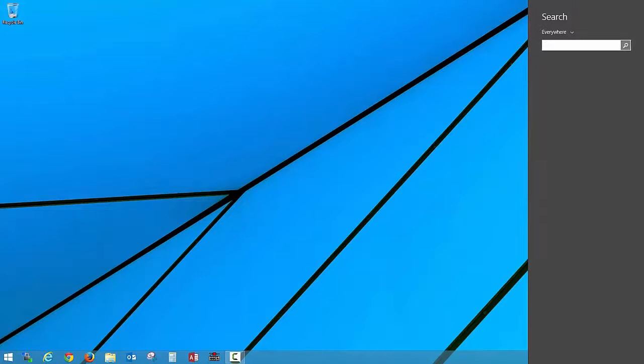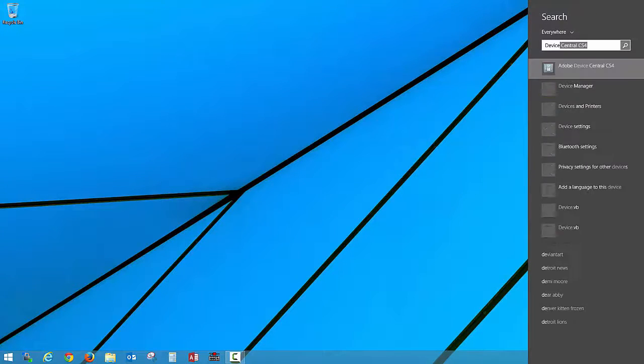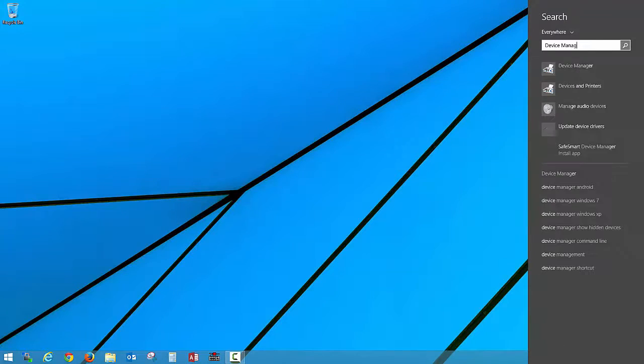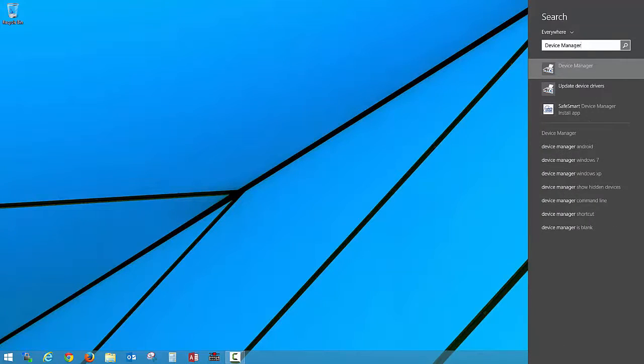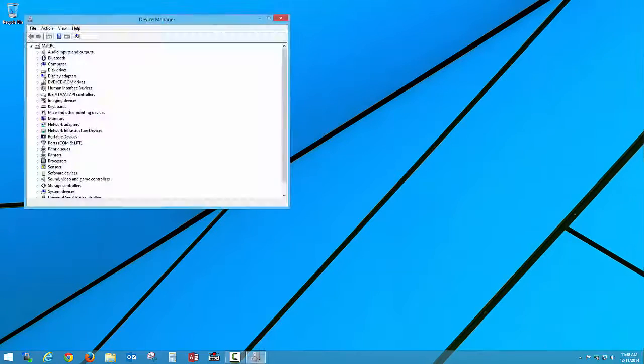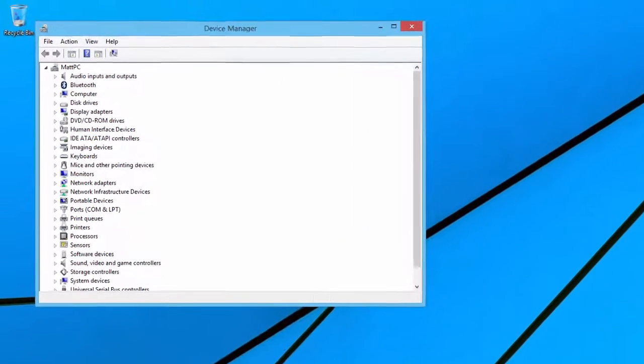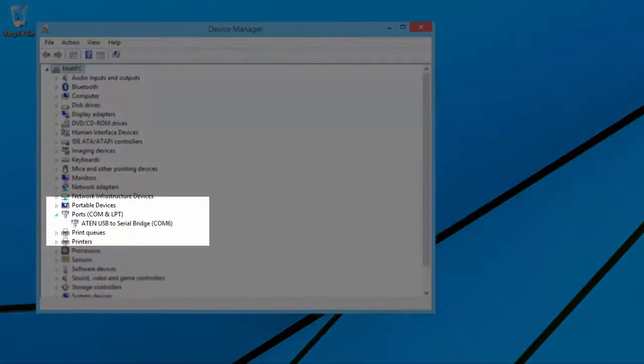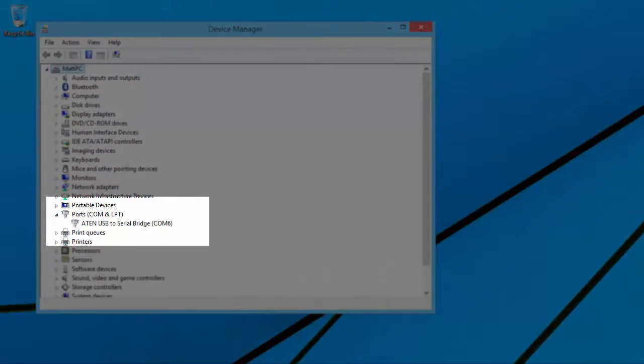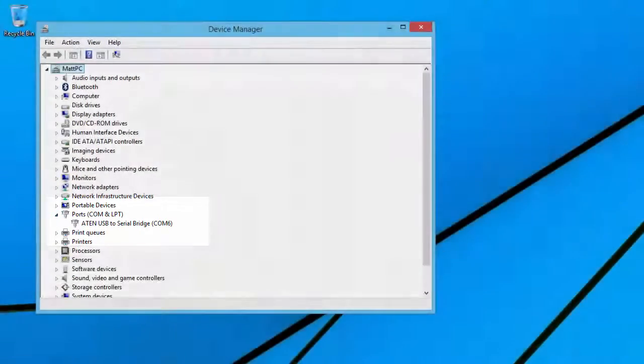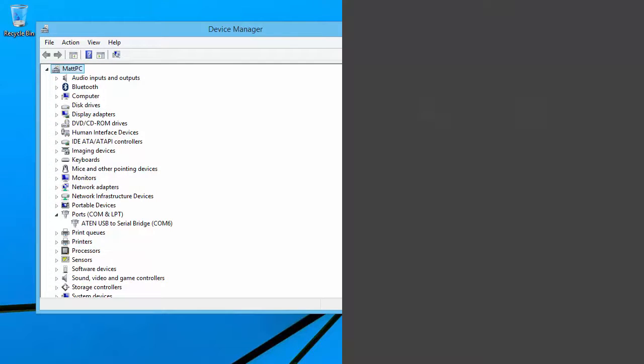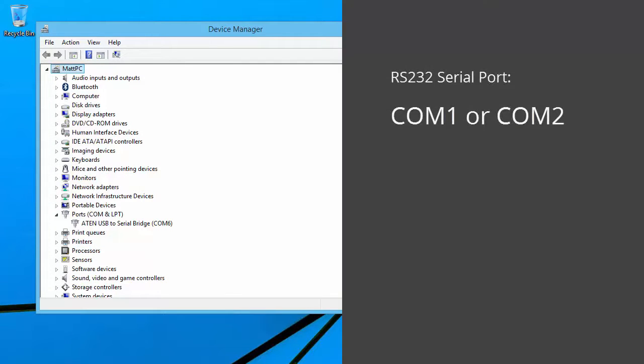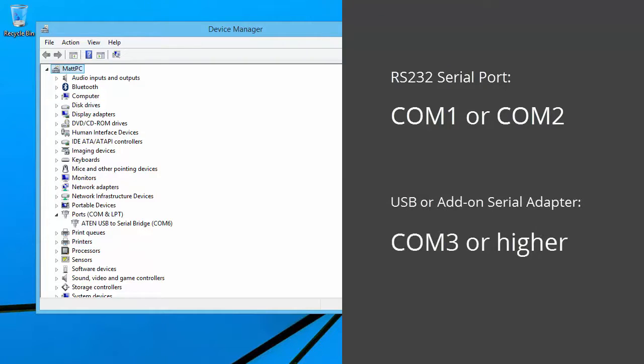Let's open up the Windows Device Manager and look in the section labeled Ports (COM and LPT). If your PC has a built-in RS-232 serial port, it will normally show up as either COM1 or COM2. If you connect the balance to a USB port, either directly or through an adapter, the COM port will typically appear as COM3 or greater.